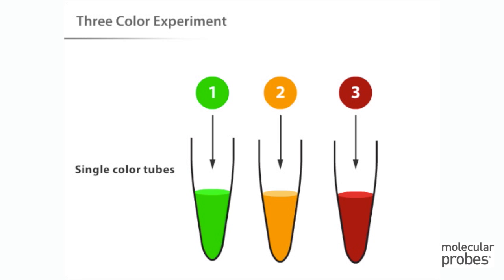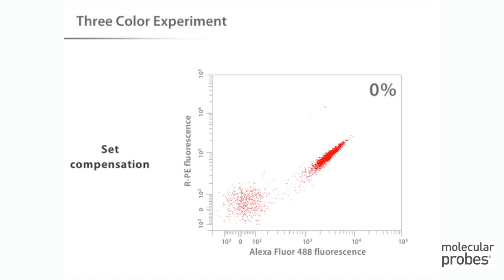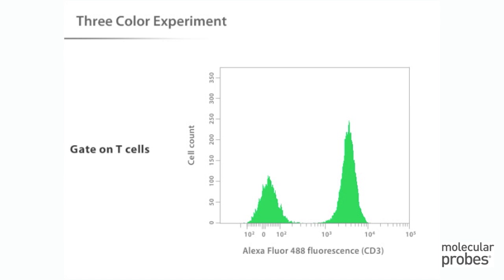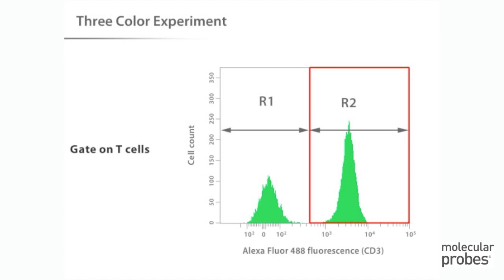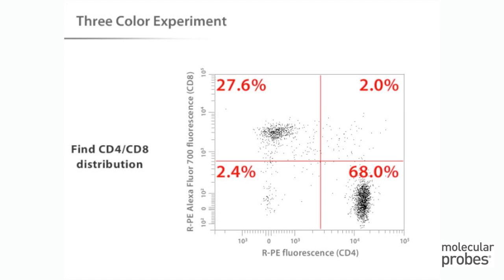Single-color tubes of the blood cell sample will also be prepared. Using forward and side scatter, we will gate on lymphocytes. Using data from the three single-color tubes, we will set compensation. We will locate the T cells using a histogram of CD3 staining and set a gate. Finally, we will use a CD4 versus CD8 dot plot to determine what percentage of the T cell population has the CD4 antigen and what percentage has the CD8 antigen.